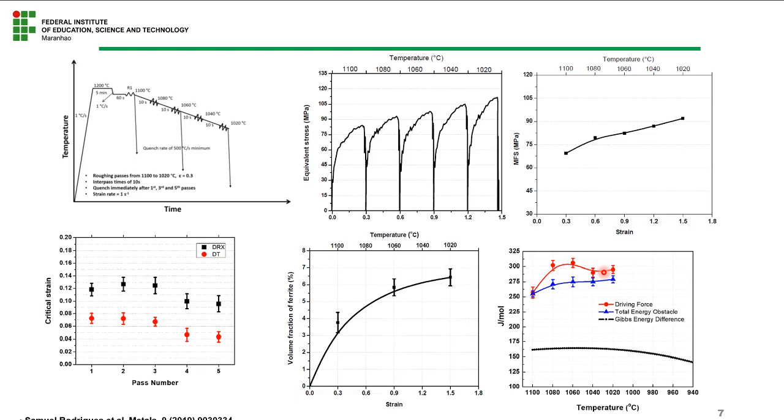So the industry uses the process thinking that there is only austenite in this kind of material. We need to investigate other materials or apply rolling strain only over austenite, but we have some amount of ferrite being strained that has been transformed due to the application of the stress.